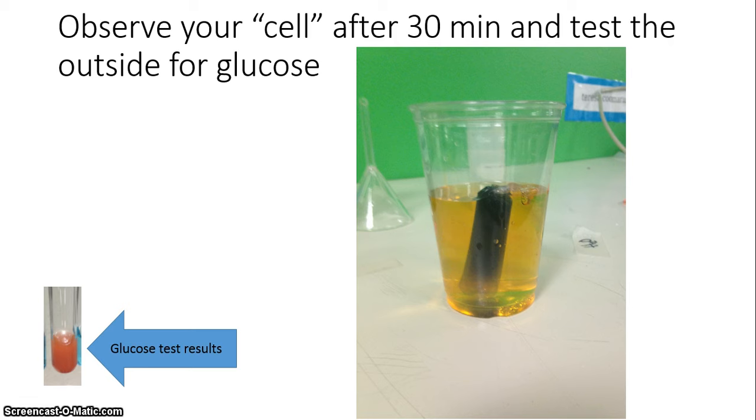In order to figure out whether the glucose was able to diffuse, we had to test that outside area. So we tested out here. And you can see over here what our results were. So we ended up with a positive result outside.